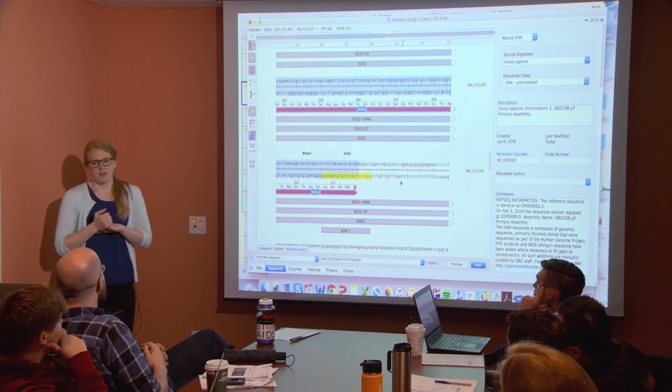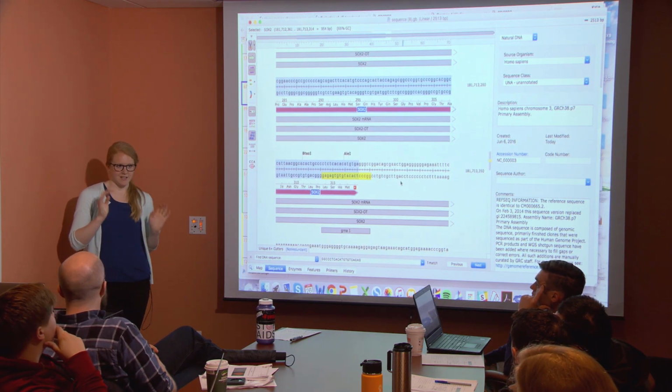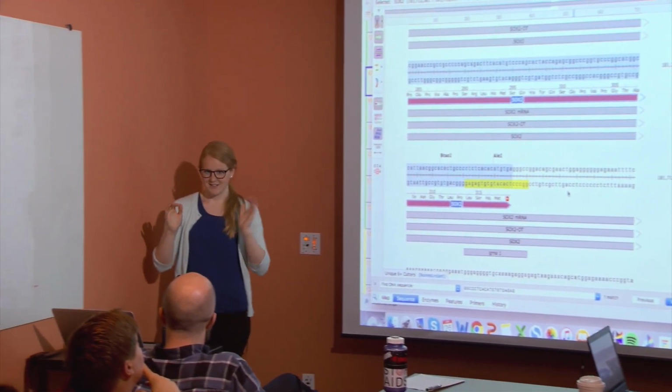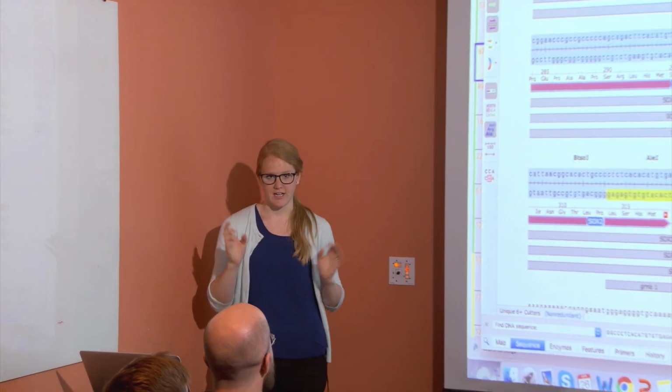The main thing I would recommend is to make another file with your end sequence, what it should look like if your donor gets inserted exactly as it is, because then you can double check and make sure you didn't make a mistake and change an amino acid or something like that. That's where this is a pretty useful tool, because it lets you do all of this in silico cloning.